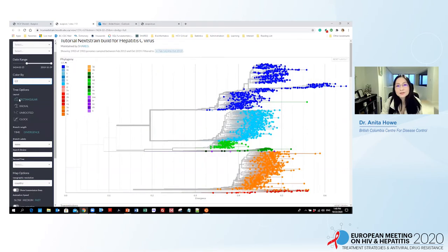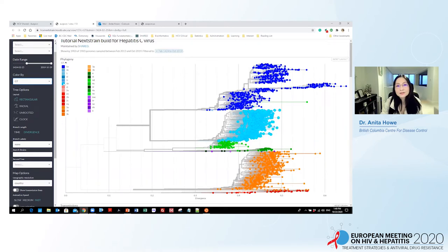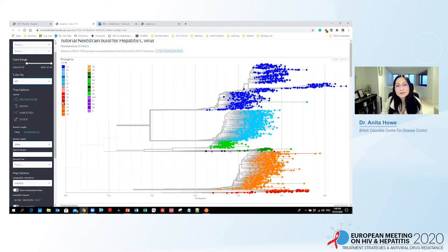Let us first look at the genotype distributions. In the phylogenetic tree, you can see that the sequences are nicely grouped into genotype 1a, 1b, and genotype 3. We only have a few sequences in genotype 4 and genotype 6, and the genotype 2 sequences are located at the bottom of the tree.